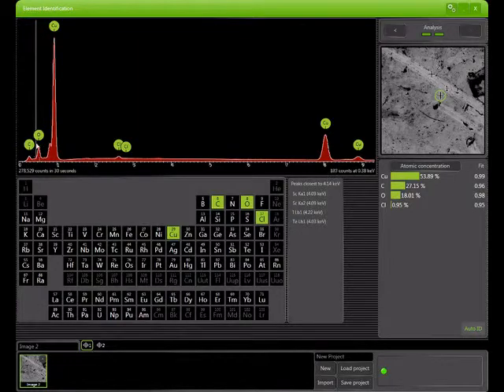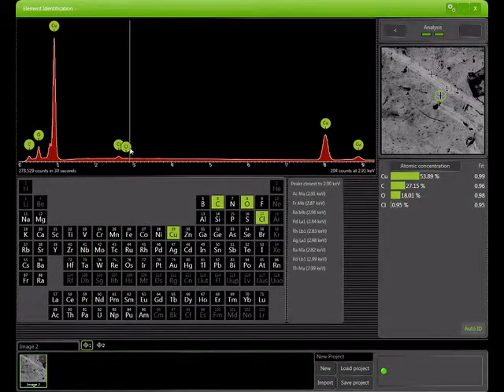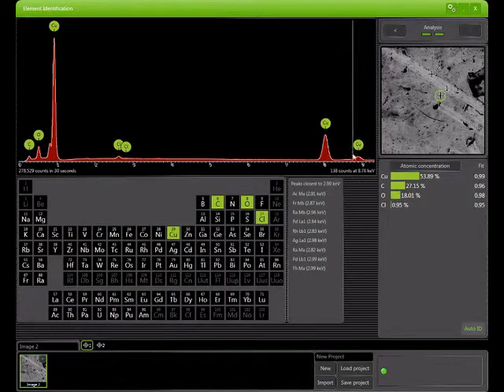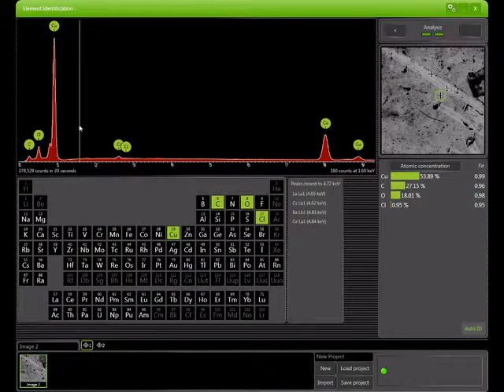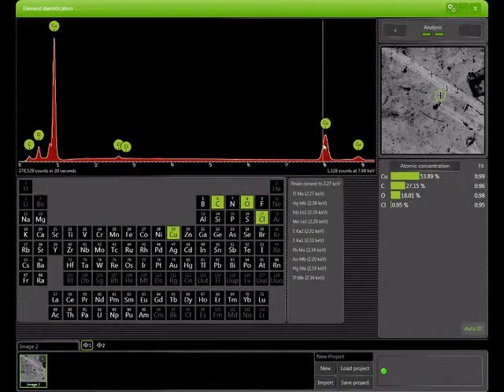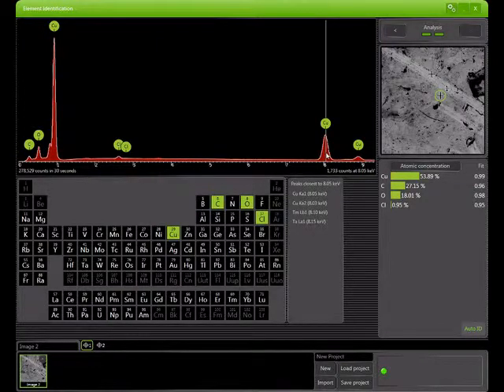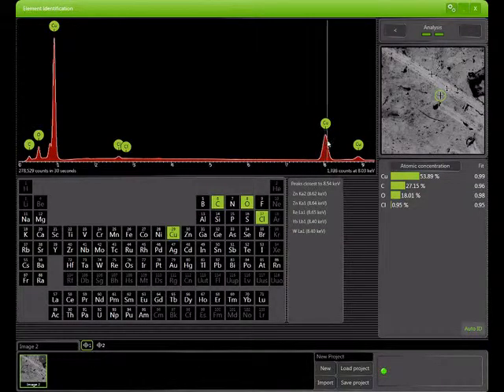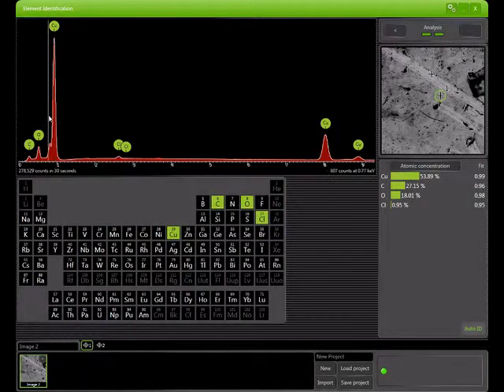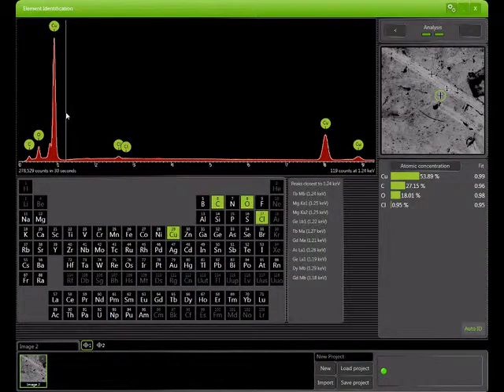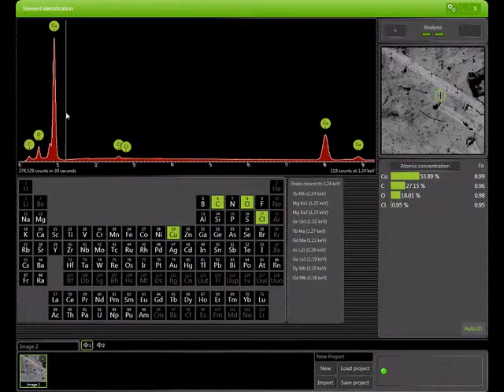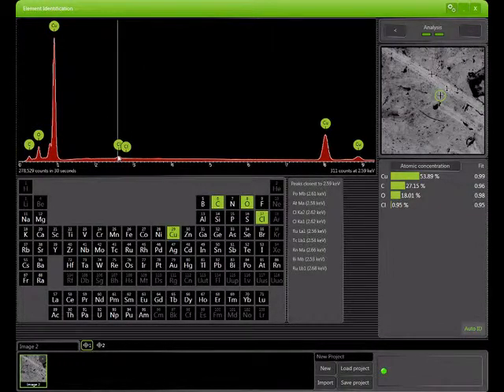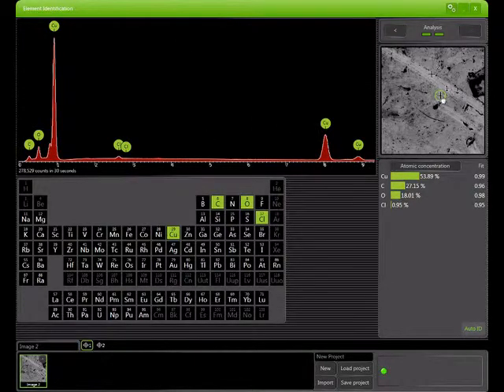So what we see in this image is a series of peaks or peak shapes, which the computer has gone ahead and attempted to identify. In this case, it's done a very good job of identifying them. Sometimes it needs some help. What this means is that at this particular location, a lot of x-rays which are indicative of copper were produced and entered into the detector. You'll see a peak here for copper, here for copper, and another set of peaks here for copper. And this is due to the atomic structure of copper and the many orbitals for electrons that it possesses compared to a simpler atom, such as chlorine, which just has a single peak here.